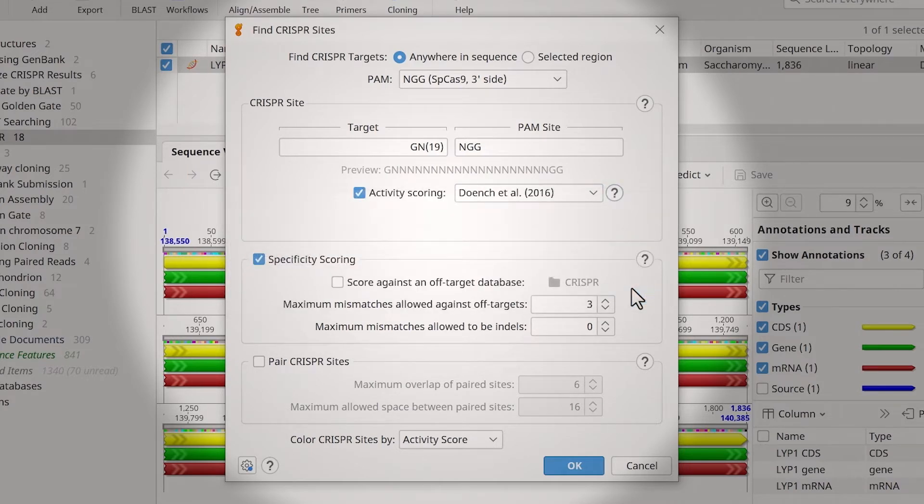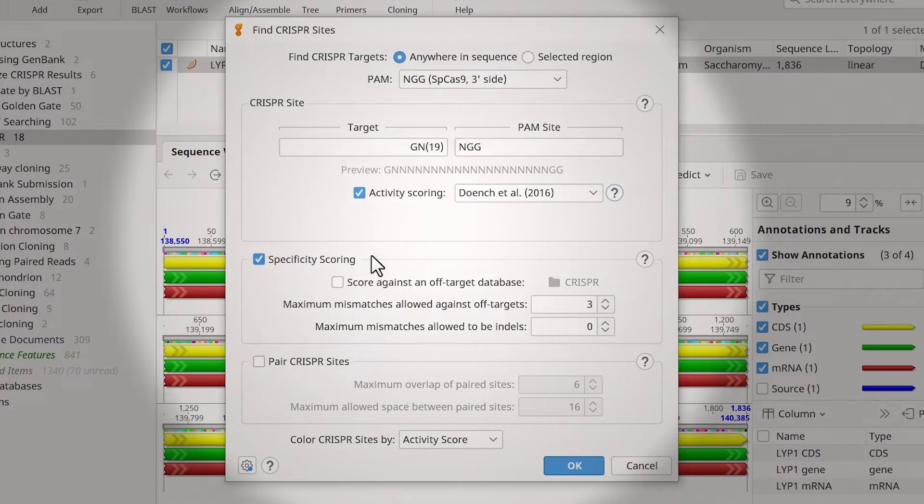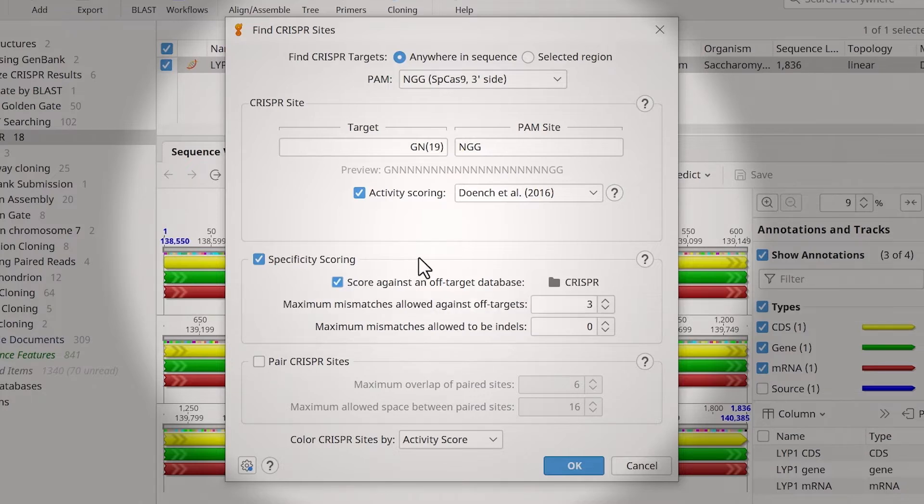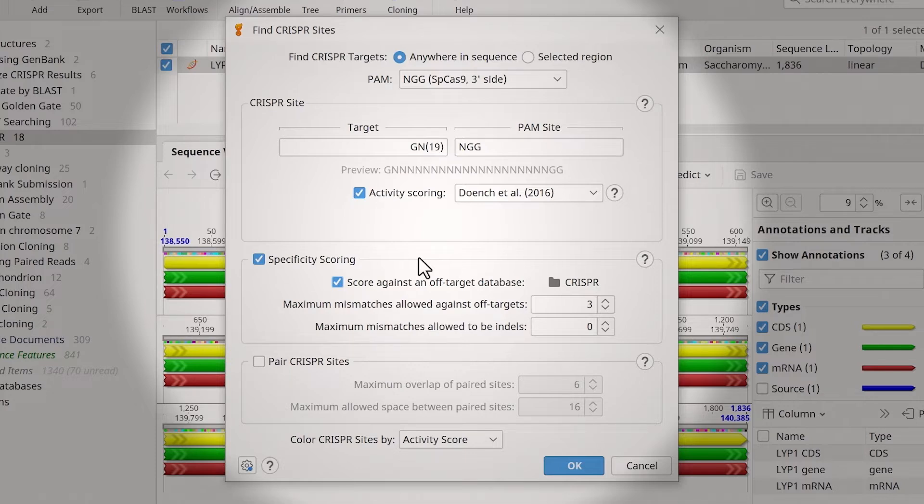To score sites based on their off-target binding, ensure the Specificity Scoring option is selected and check the score against an off-target database. The off-target database is typically the whole genome of your organism of interest, but can include other sequences such as the targeting vector.